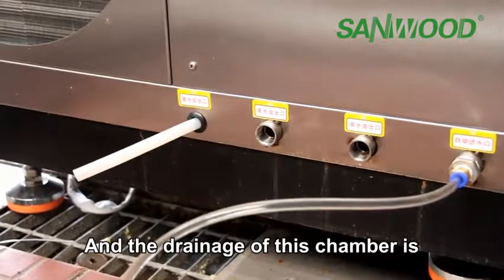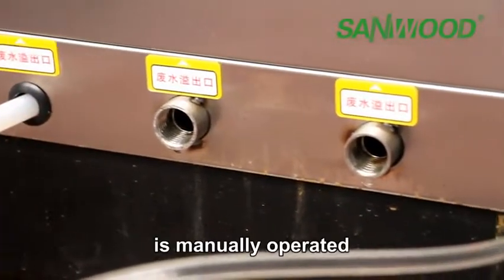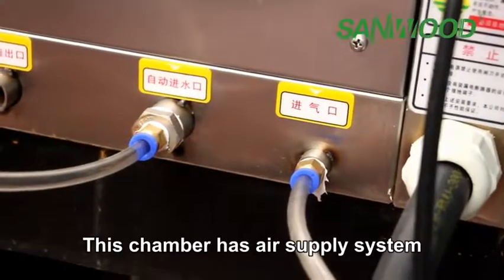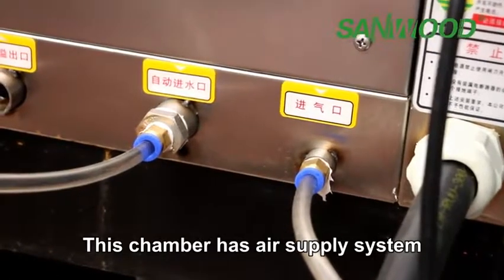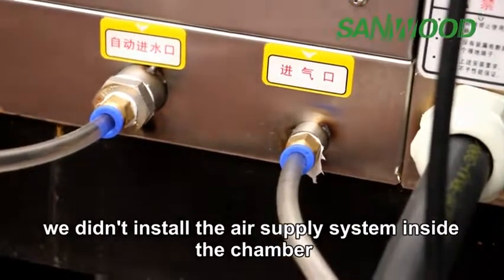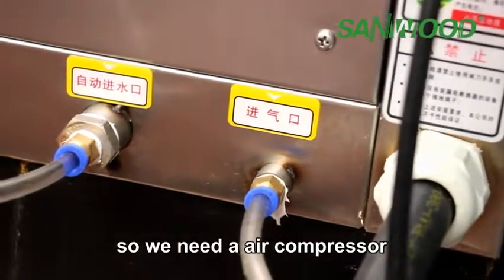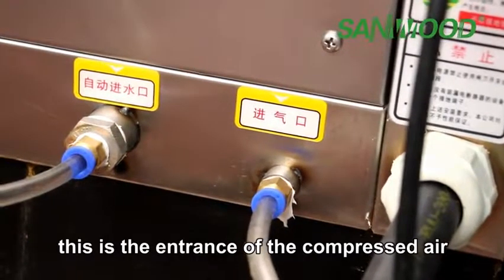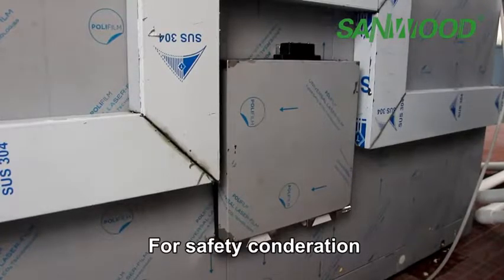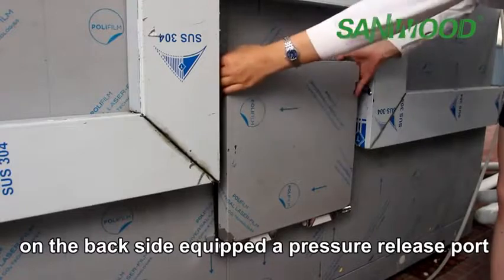The drainage of this chamber is at the bottom part of the chamber. It is manually operated. This chamber has an air supply system. We didn't install the air supply system inside the chamber, so we need an external air compressor. This is the engine of the compressed air. For safety consideration, on the back side, it has a pressure release valve.